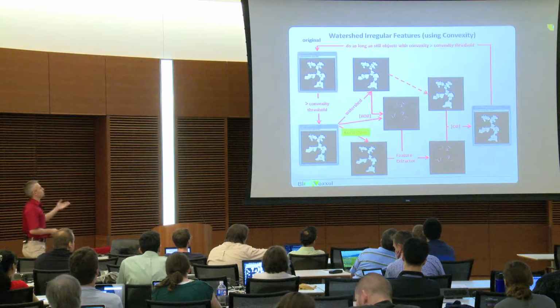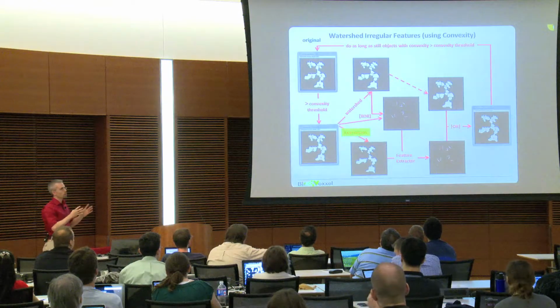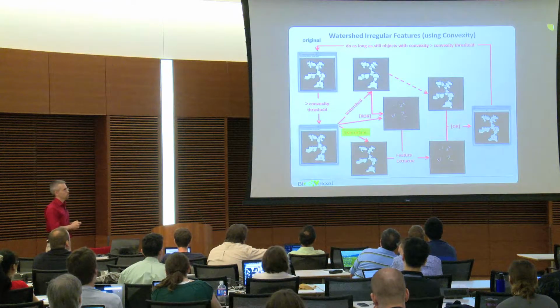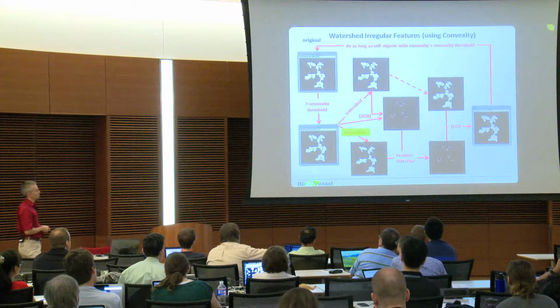And the convexity option does it similarly. It first selects only particles in the image which have a certain higher convexity, and then does a one-time erosion, and does this as often as there are particles with a higher convexity than that.